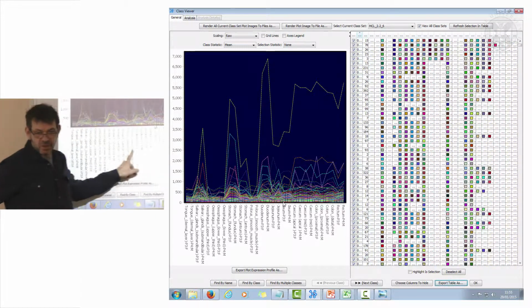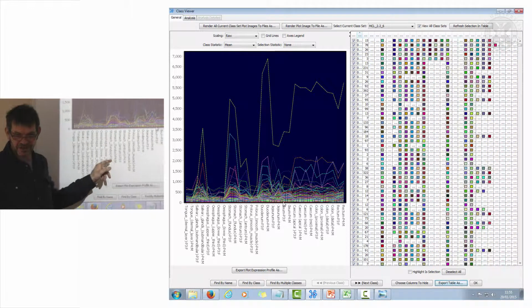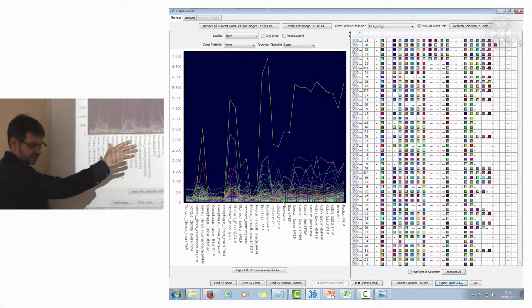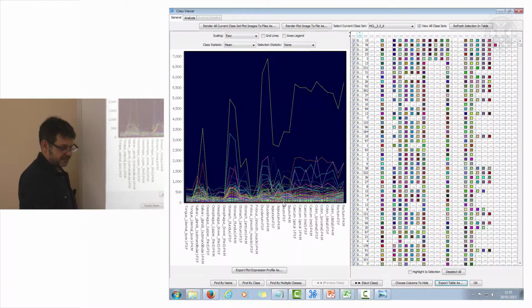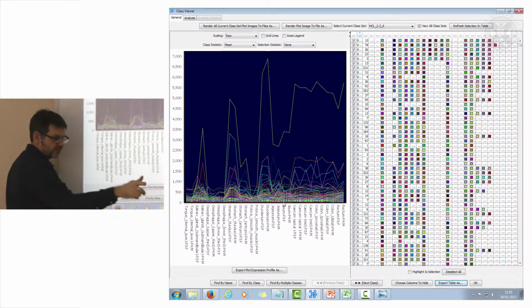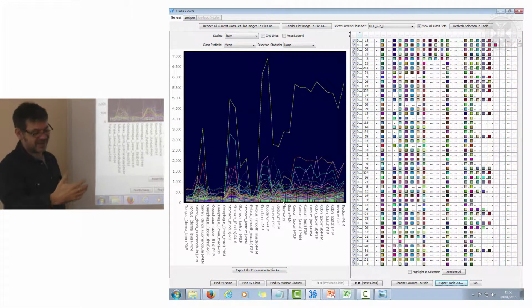You don't want to average out your replicates, because if you have got a set of dodgy replicates, you will see it obviously. So generally when I'm looking at a replicate, so Claire with her time course, how many time points do you have? 4. 4 time points. 3 rats. 3 rats. 2 replicates. Okay, so I would want to take each rat and show it as a separate group, 0, 2, 4, 7, 24, 0, 2, 4, 24, so that if one of the rats, once you start looking at individual animals, they respond differently. And it's kind of useful to see that.